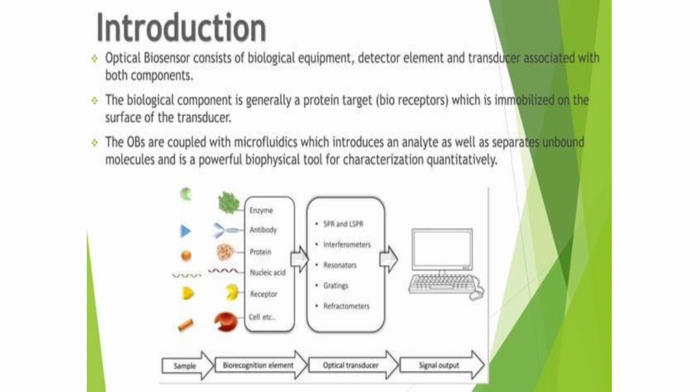An optical biosensor is an integrated analytical device that consists of a biological recognition element, a physical detector element, and a signal transducer element, which is directly connected with both these components. The biological recognition component is actually a protein target, that is, a specialized bioreceptor.